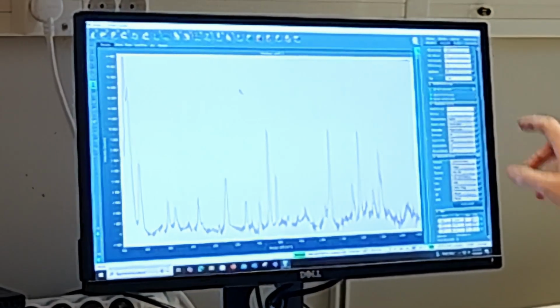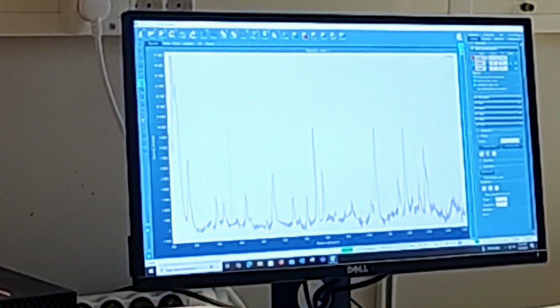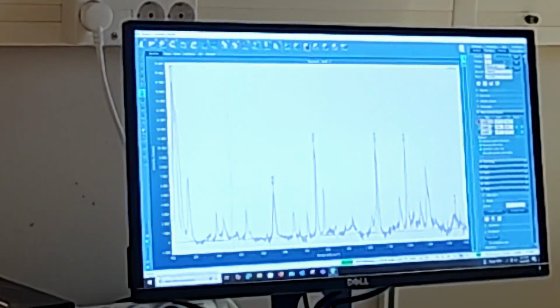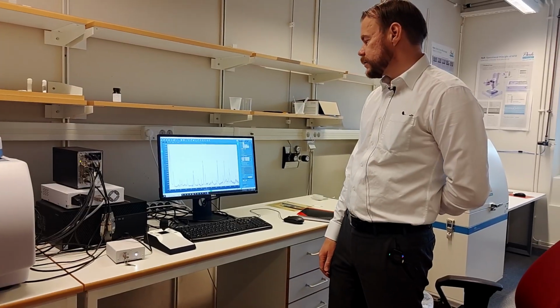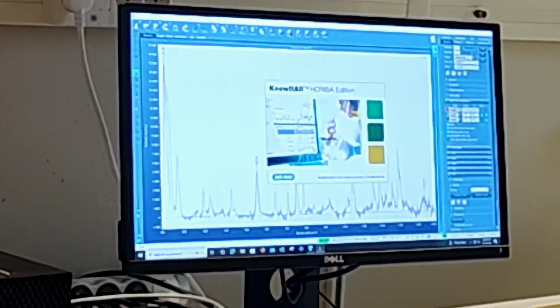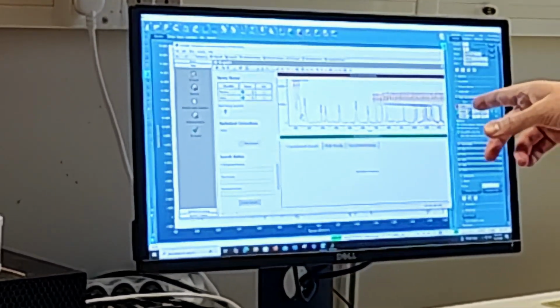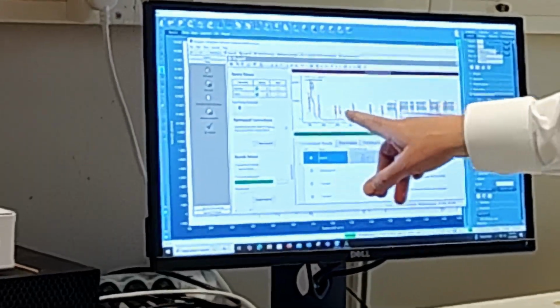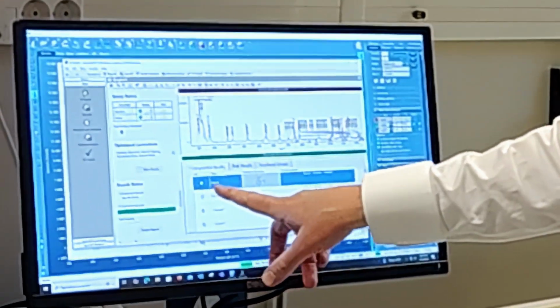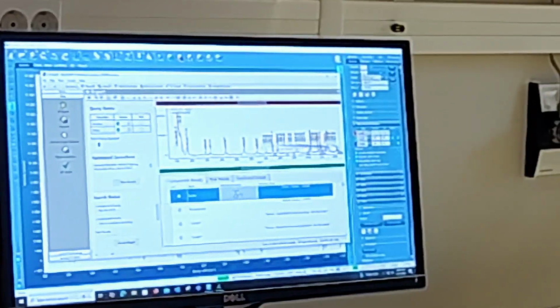You can continue here in the tab and go to analysis, for example. You can open the peak tab. And here you can choose to identify peaks and so on, where they are. You can also click on this wizard here, and then it will see. Yes, so here it puts the data. You can look at this more in detail, but I don't want to talk too much. You see it makes some identification, one compound, so it says aspirin, which is acetylsalicylic acid.